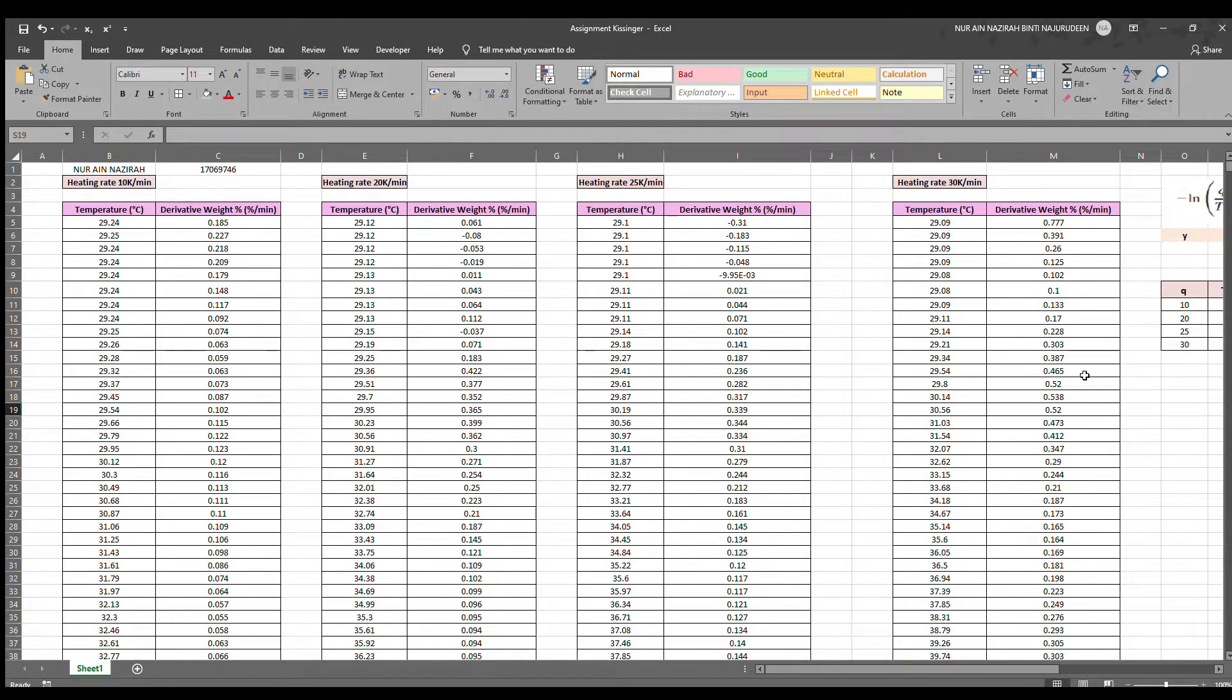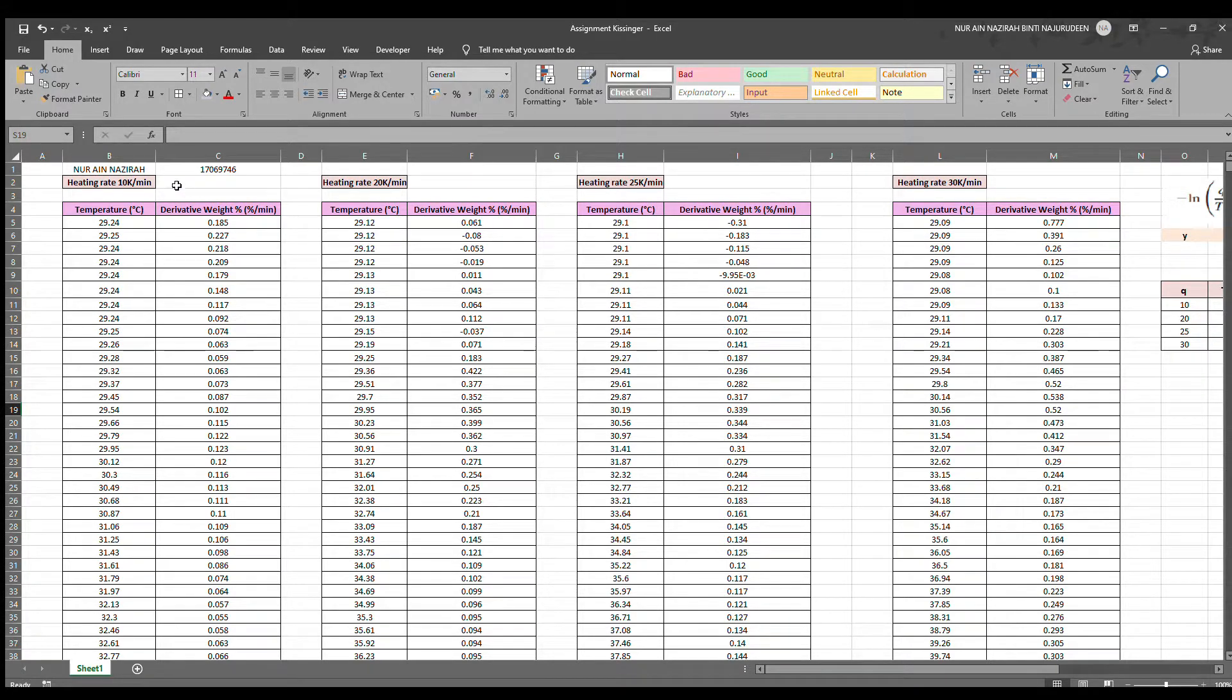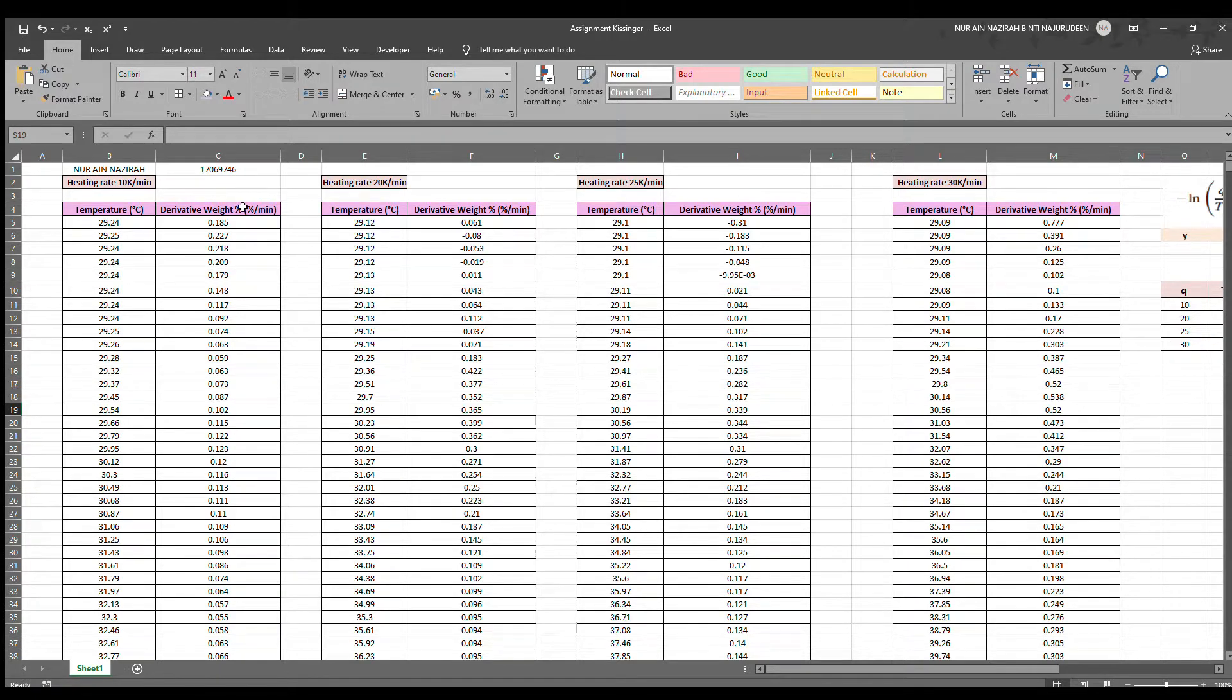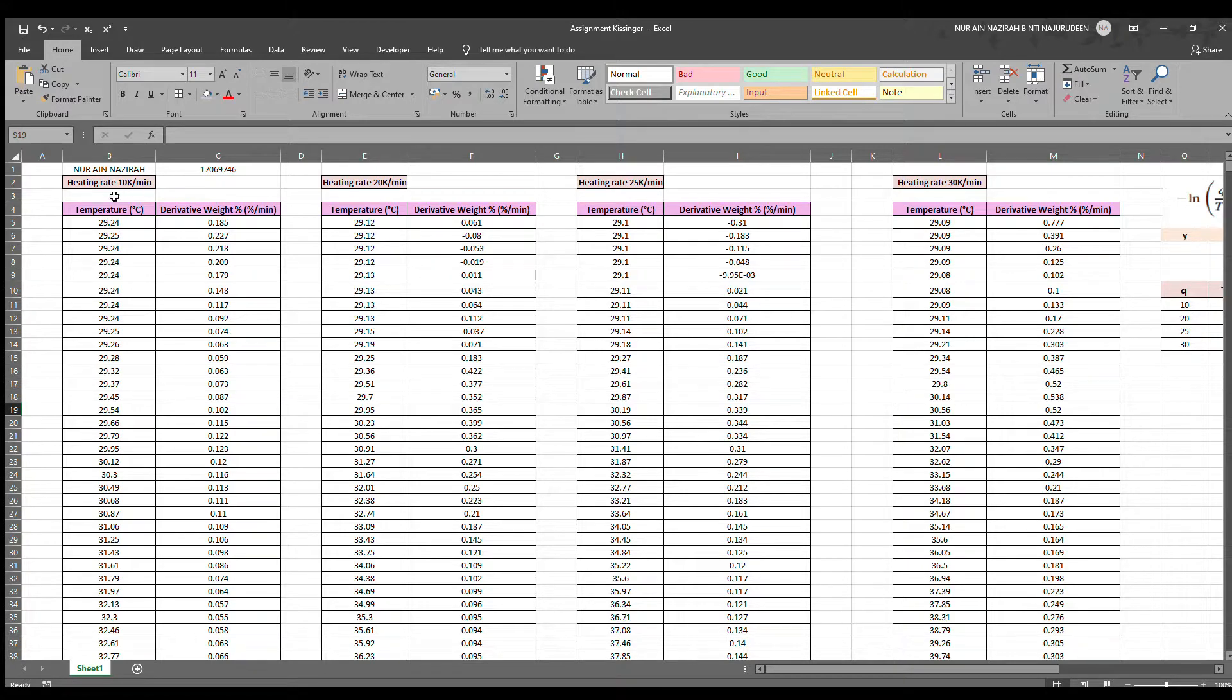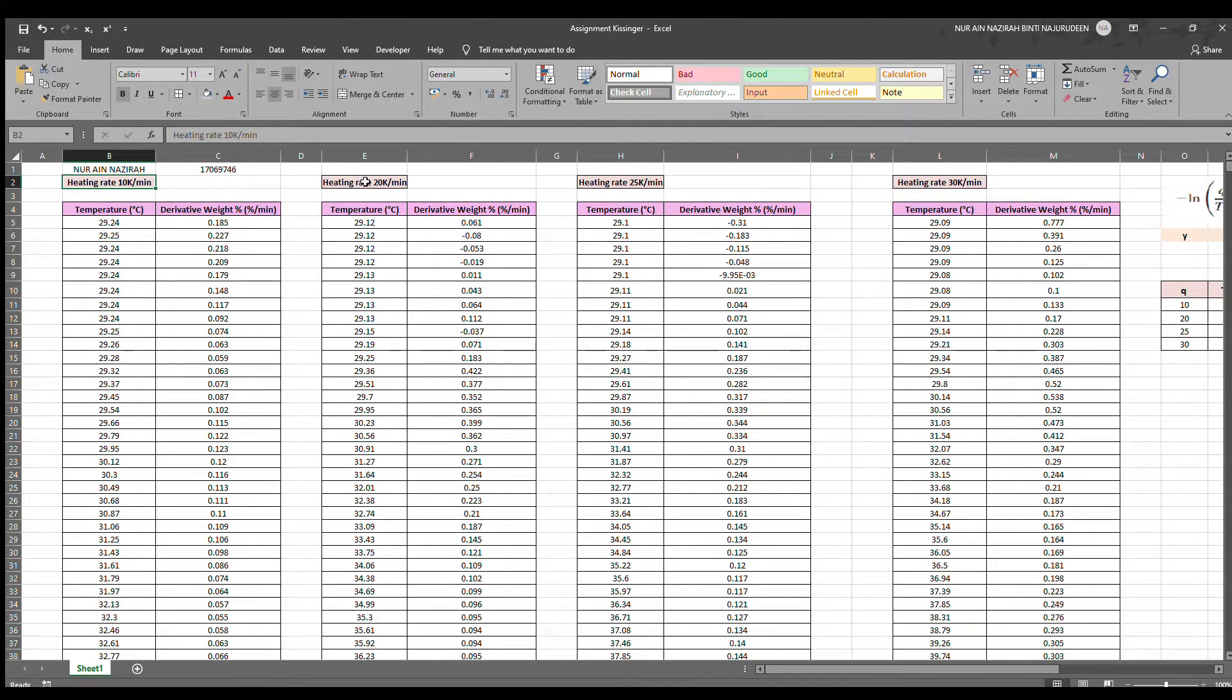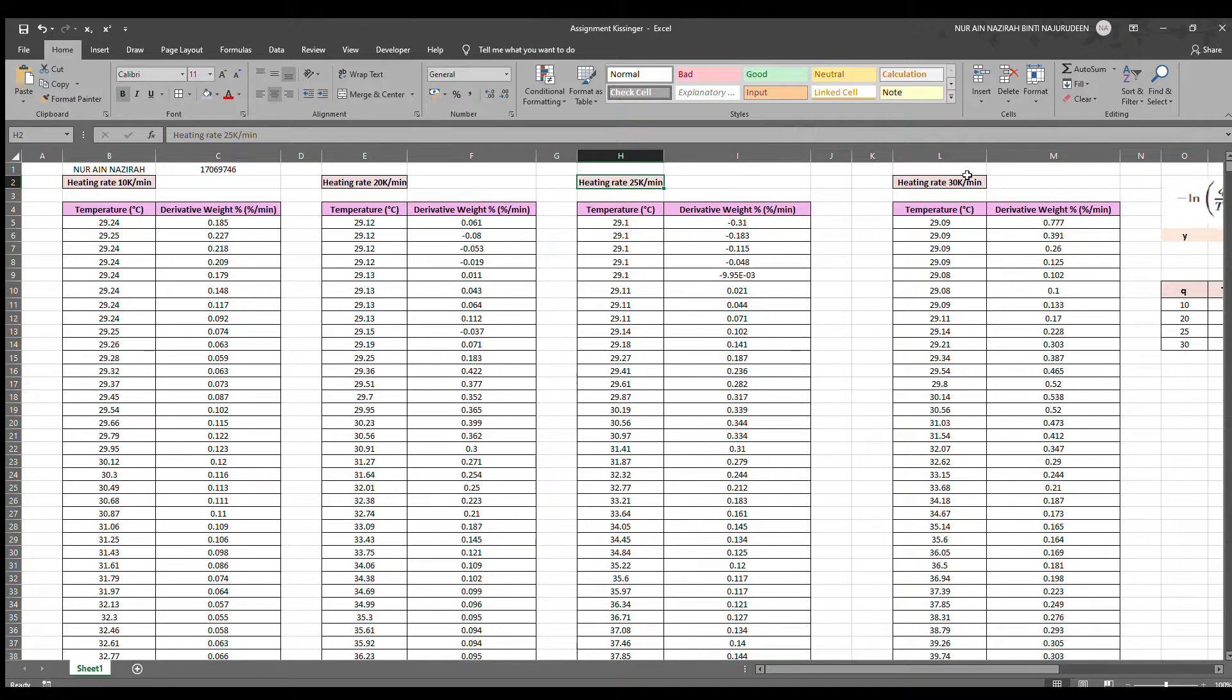From this Excel window, we can see all the data of an experiment. In this experiment, we have four sets of data corresponding to four heating rates which are 10, 20, 25, and 30 Kelvin per minute.